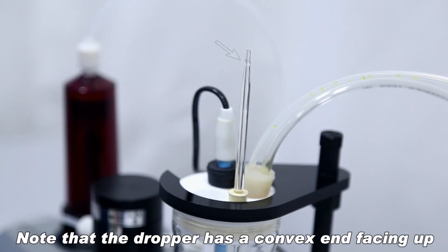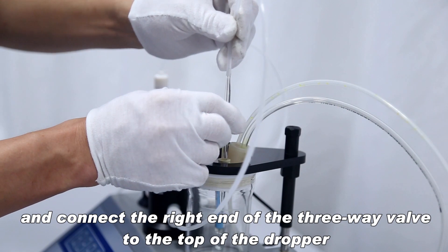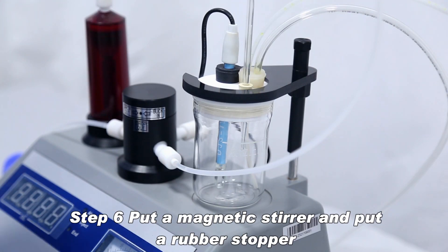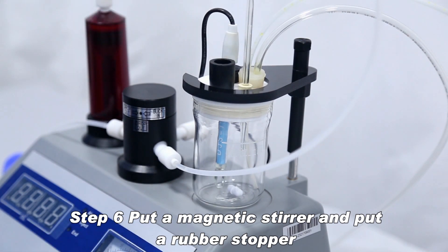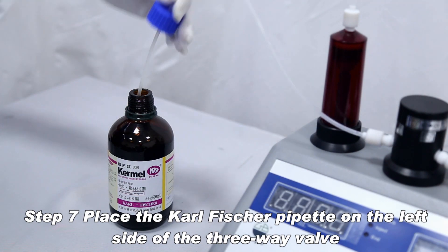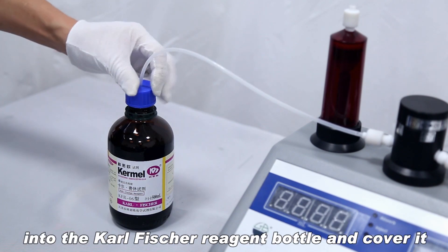Note that the dropper has a convex end facing up and connect the right end of the 3-way valve to the top of the dropper. Put a magnetic stirrer and put a rubber stopper. Place the Karl Fischer pipette on the left side of the 3-way valve into the Karl Fischer reagent bottle and cover it.